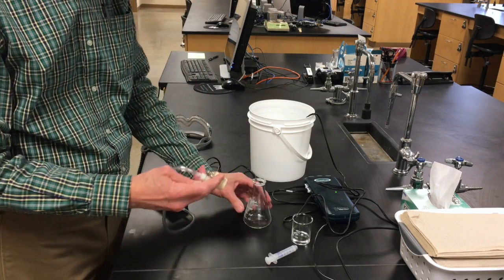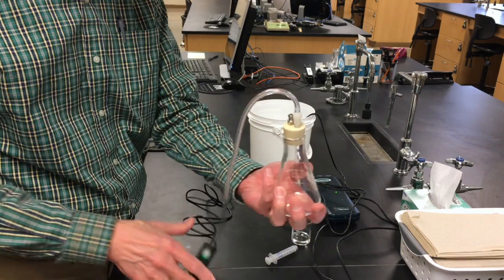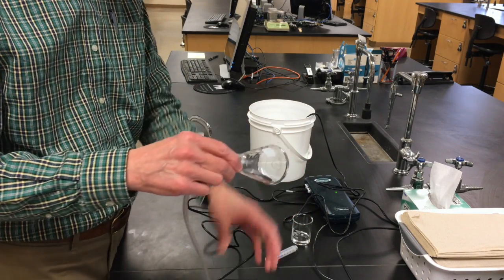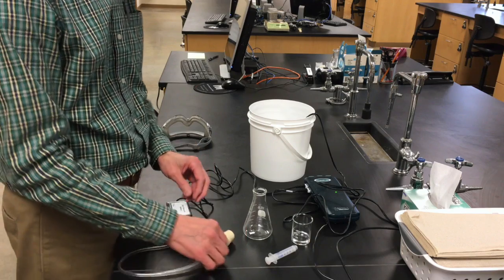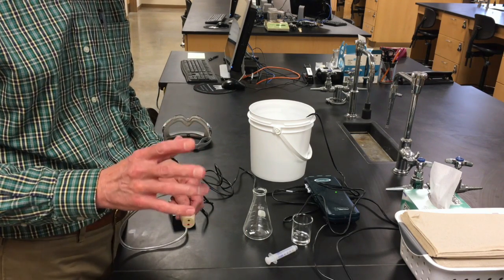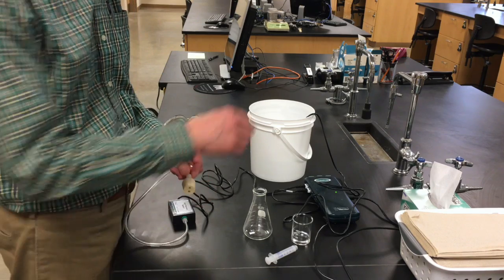Now we need to connect the two-hole stopper to the Erlenmeyer flask, but just pushing it in like this, that looks sealed, but that's not good enough. We want to make sure that this really seals. That would leak. So the way to do this, as it describes in the procedure, and by the way, this pre-lab video is not a substitute for reading the procedure, both before you take your pre-lab quiz and before lab.